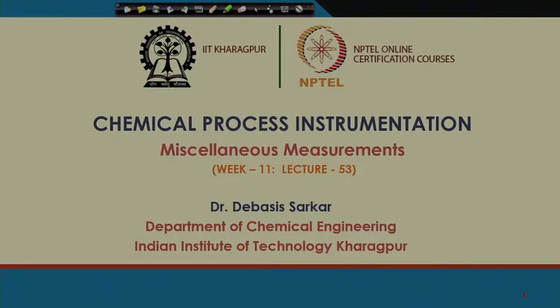Welcome to lecture 53. In our previous two lectures, we have talked about gas chromatography and liquid chromatography as tools for concentration measurement. In today's lecture, we will talk about spectroscopic method for measurement of concentration. Specifically, we will talk about ultraviolet visible spectroscopy for measurement of concentration.